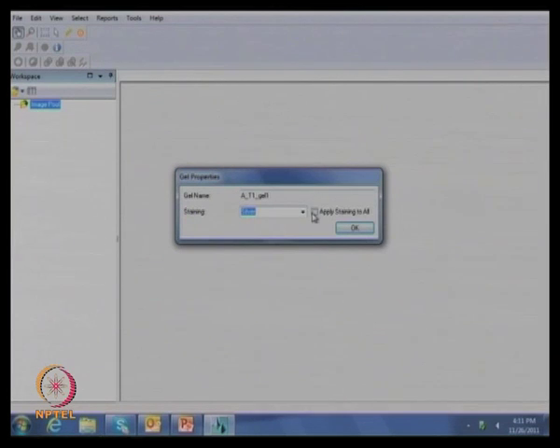So, you are processing 6 gels at a time. These are all the 6 gels. Basically, 2 replications, like 3 replications for each gel actually. Right. That means one is control and another is the treated in that way.